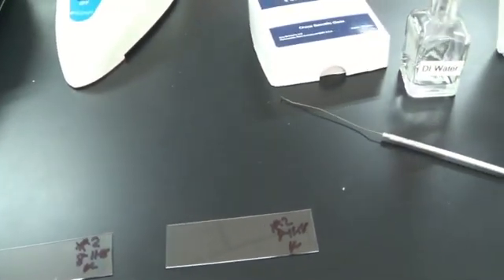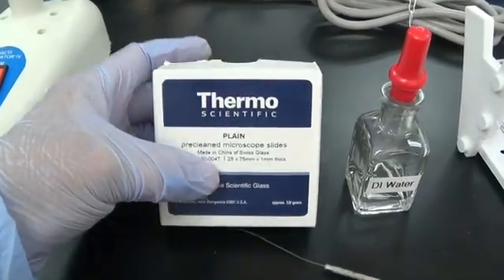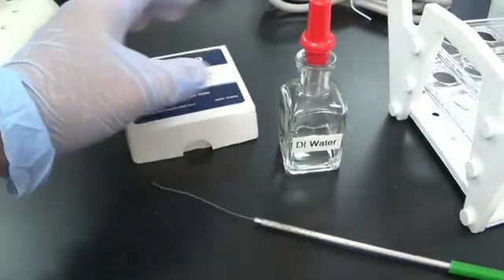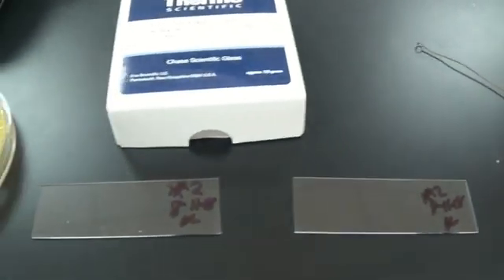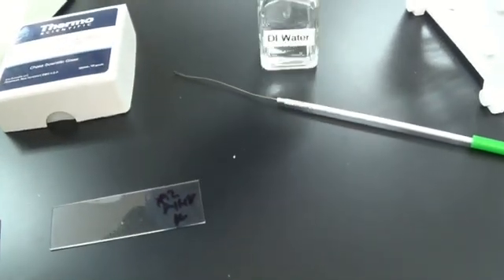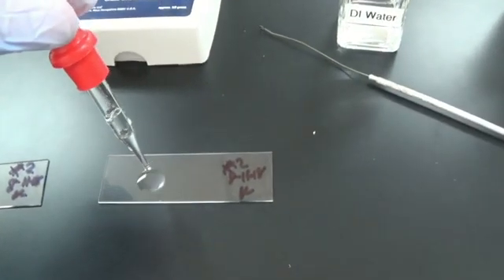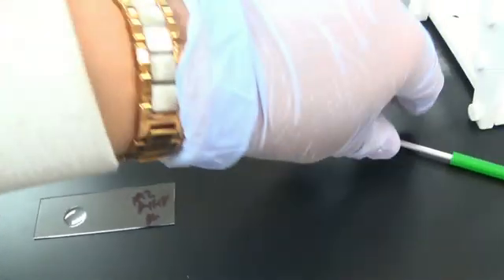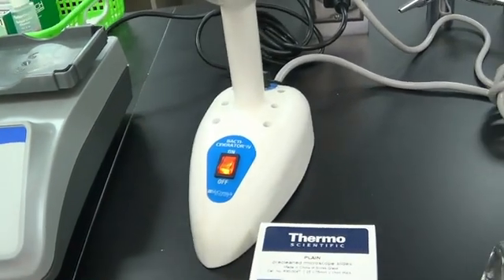For gram staining we are using these pre-cleaned microscope slides, a little bit of DI water, a dropper, and our labeled slides. This is one way of doing it. To do this, take a drop of DI water, put it on your slide, take your loop, and sterilize it.